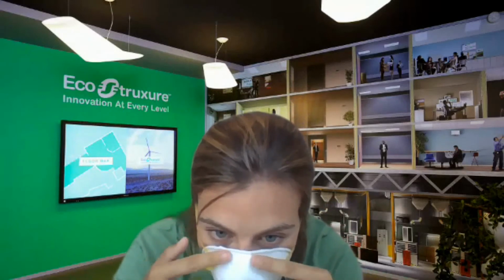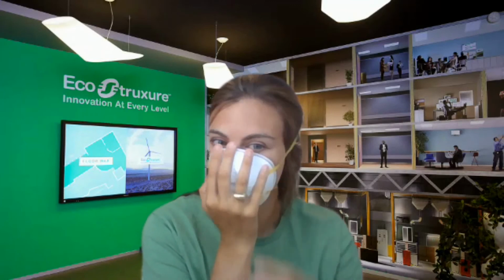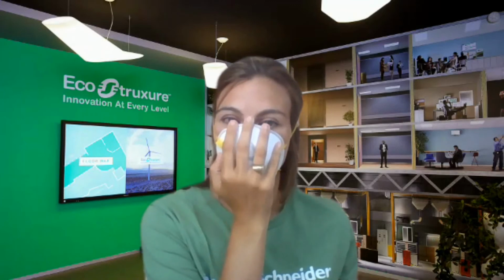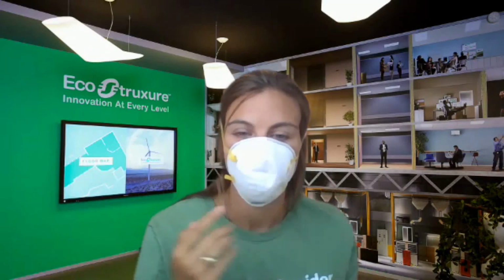I'm going to push along the bridge of my nose just to make sure I form it to there. These do come in various sizes, so if the one that you're provided does not fit you, please escalate and let someone know. A good way to fit test this is putting your hand over your face and breathing outward, making sure that you can't feel air coming out and touching your hand. This will protect others from your particulates and you from others.